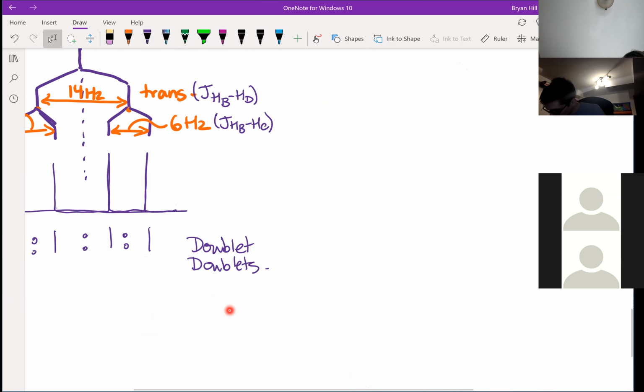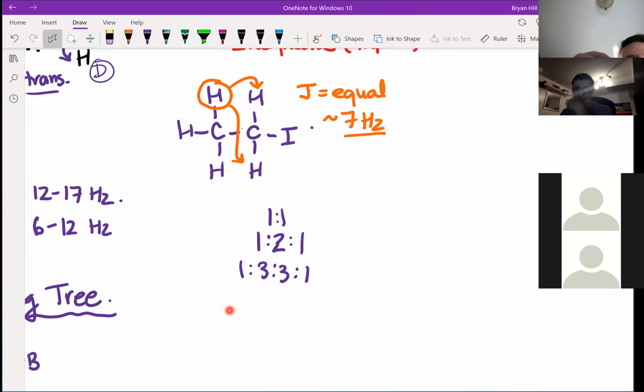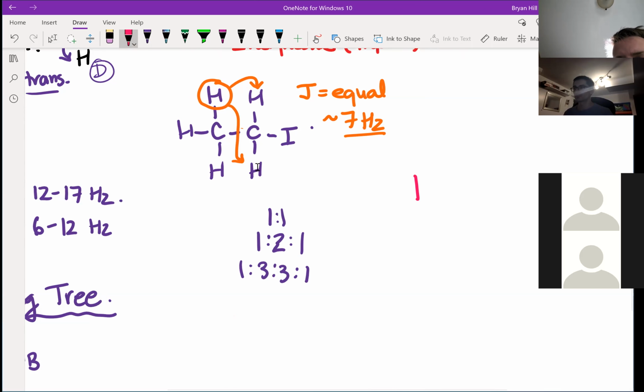Now, if we just return to the Pascal triangle case over here, where these 3 protons all appear as a triplet because of this proton and this proton. The way that Pascal's triangle actually works is, if this is your normal chemical shift, you're split once at, say, 7 hertz, and then you're split again at 7 hertz.